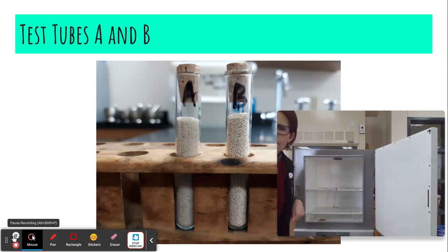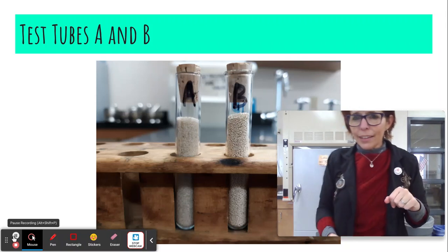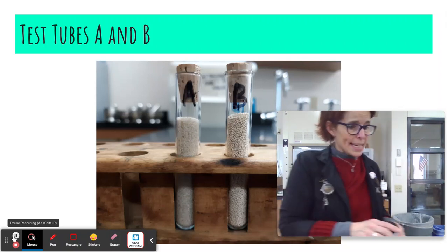I don't know if you can even see them in there, but they're in there, and we'll take a look at them in about half an hour to 45 minutes. Let's close them up, and let's get started on the next one. Let's go ahead and experiment to try to see if either of them has DNA.